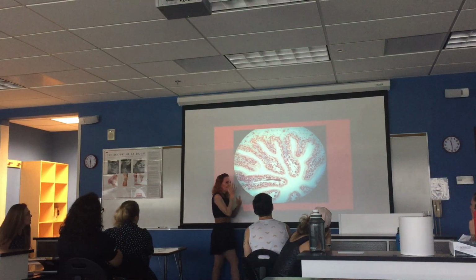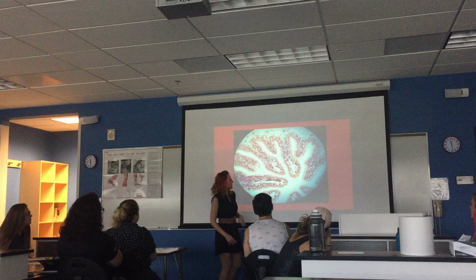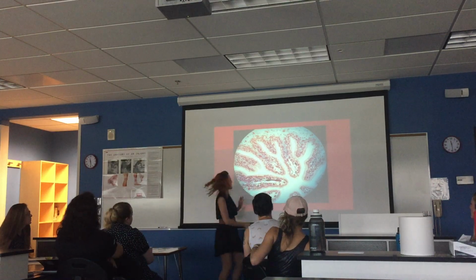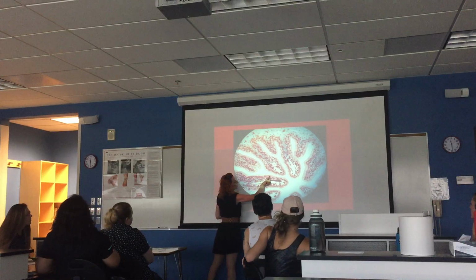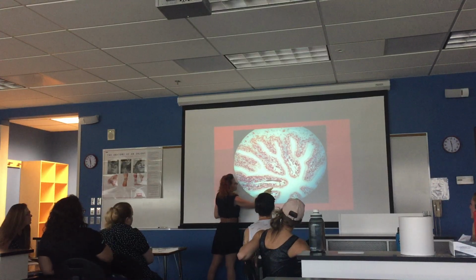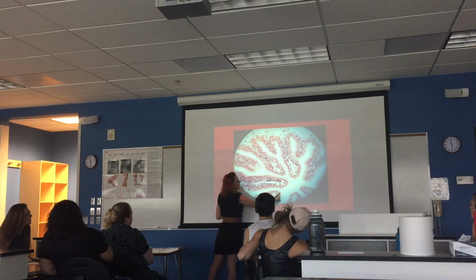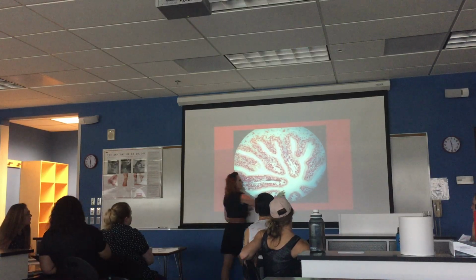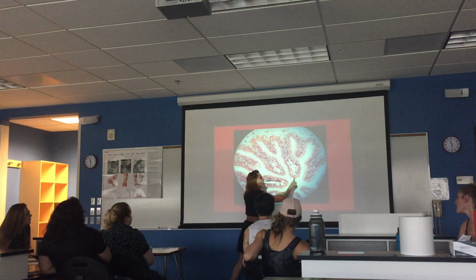Okay, so lining these fingers. Sometimes people, when they see this, think this is columnar, this is columnar, this is columnar. No. Okay, these are villi. Here are the columnar right here, lining all along. Okay? So the columnar are in contact with food, which is in here, and goes to the columnar.